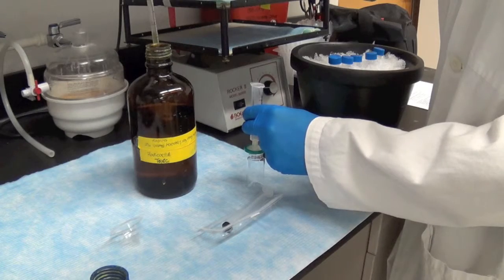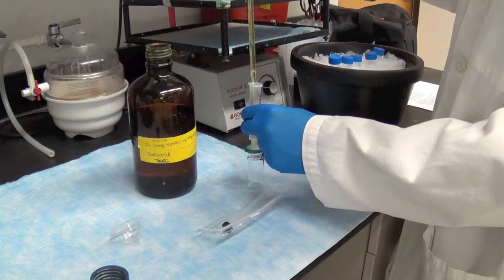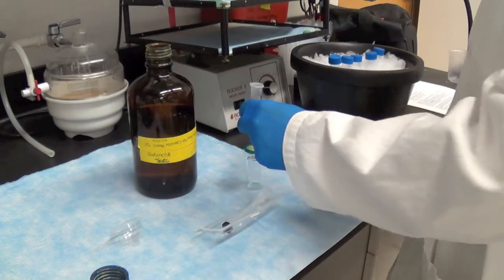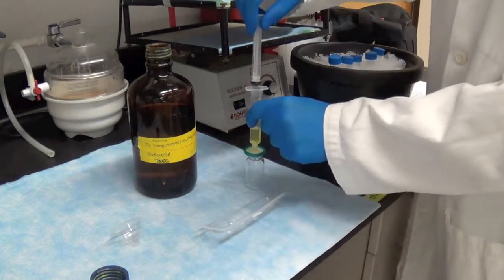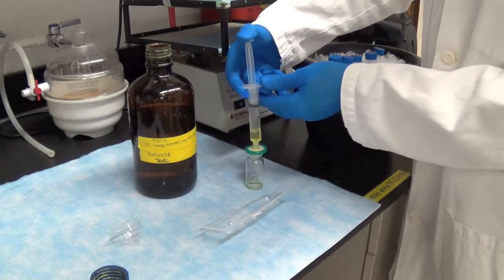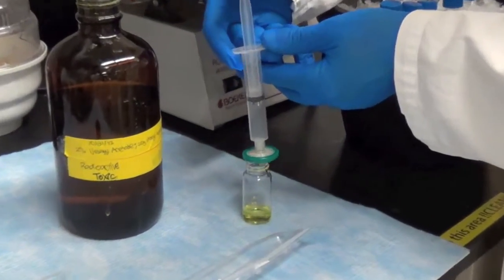After osmium fixation, we typically stain our samples with uranyl acetate. This gives additional contrast as it labels proteins generally. If the signal from the photooxidation is weak, this step may be left out so that more contrast comes from the photooxidized area. Before using the uranyl acetate, we always freshly filter a solution of 2% UA before staining.